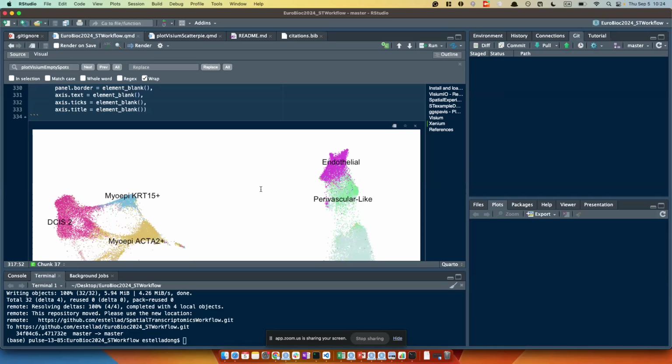Are there any more questions? Plot polygons. I asked Dario yesterday, so he has that in SpaceTrooper. I think Samuel from the poster mentioned that there is a package called Voyager that already handles that. So I would like to try that and maybe incorporate it in here.